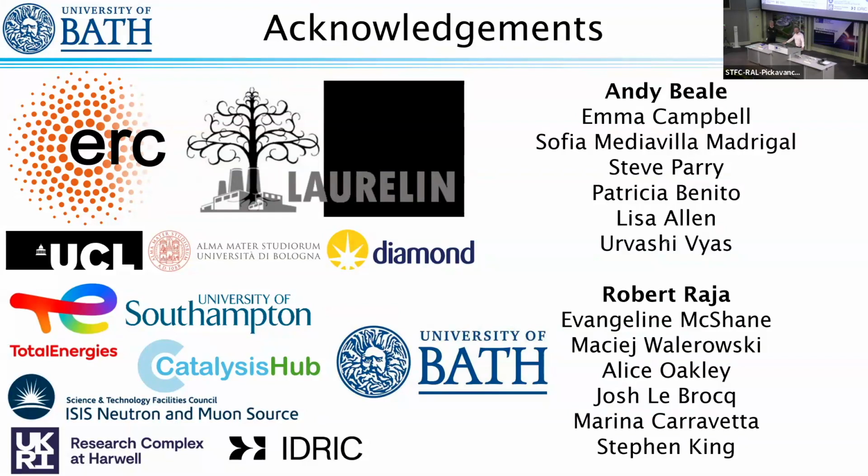Can I ask? You said in the palladium indium system there was no alloy. I was trying to look up what the palladium indium distance was. What is that compared with the palladium distance? It's actually very similar, annoyingly. The reason we determined it is because we couldn't see anything in the indium at all. And we also looked at the temperatures at which the changes started to happen. The palladium change happened quite a little bit earlier than the indium as well. So that's one of the ways we determined it.